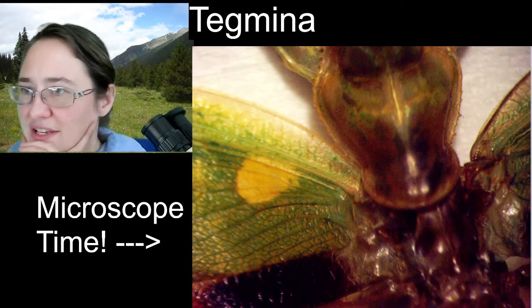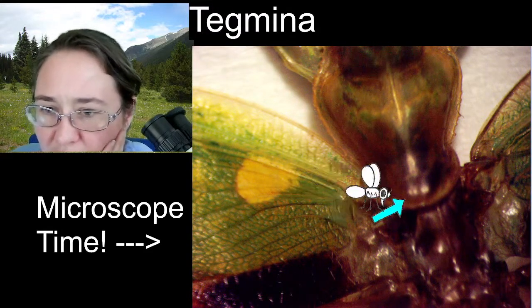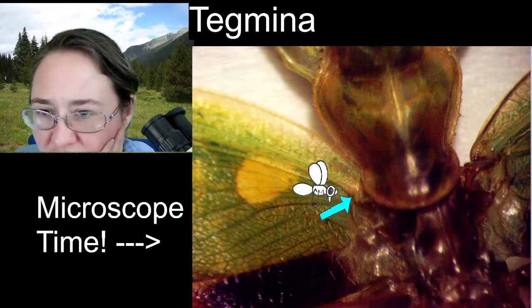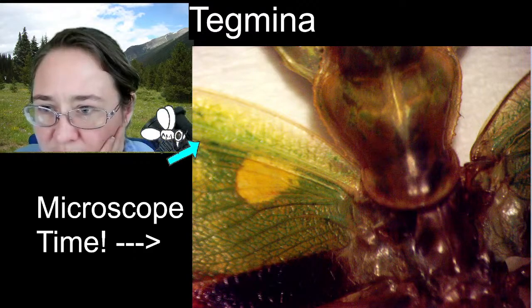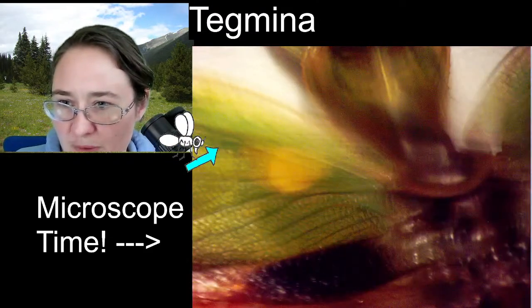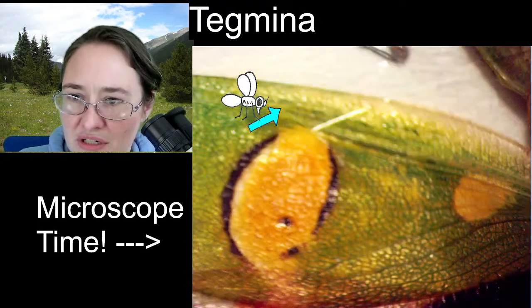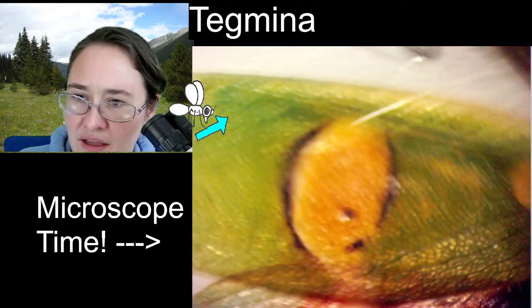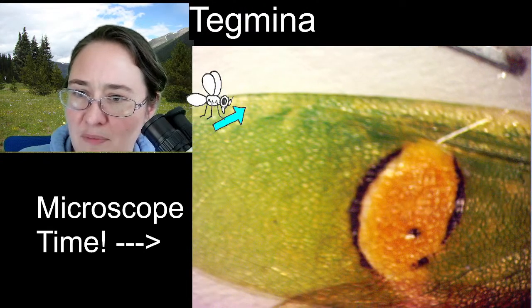So, this vein is the one I'm talking about. It connects right here, and this is where the wing is going to connect to the base of the pronotum. All right, that's where it connects. Now, this vein, you can see it's really, really thick, and it comes out in this direction. And then we're going to scoot this specimen over and follow that vein. It goes out to right above the eye, and then should end... Yeah, it ends up here.